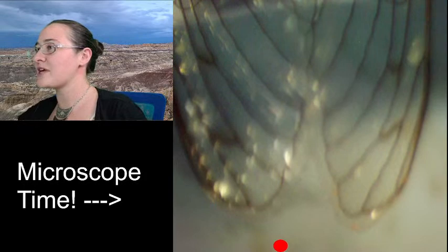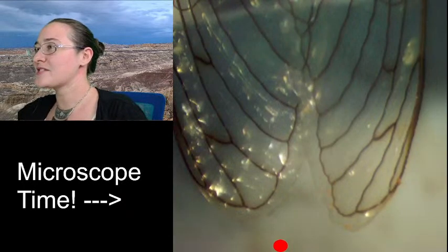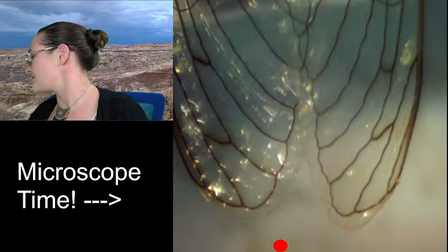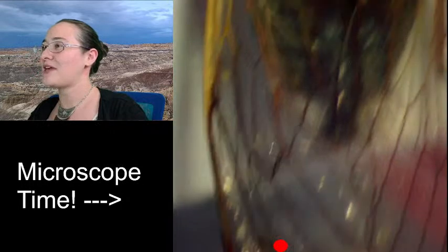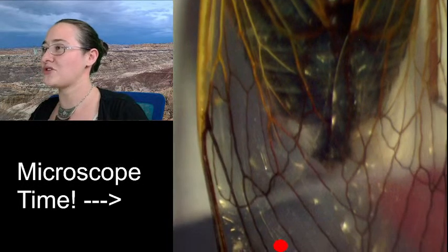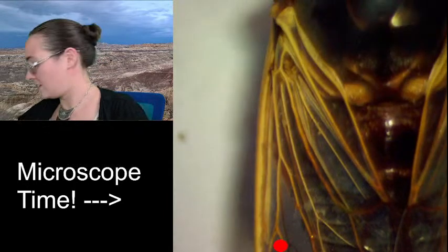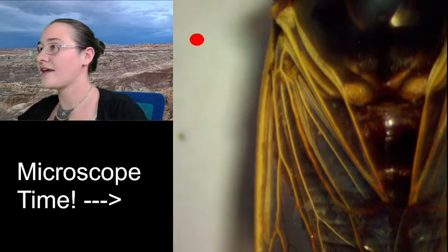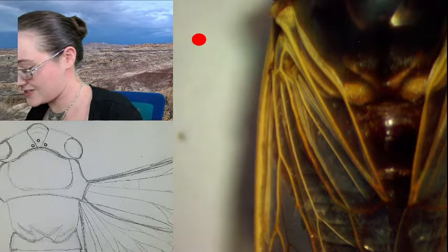This specimen is just a little bit off-center, but generally when they're alive and happy, they hold their wings central over their body. And then I can go back and we can look at the hind wing, if some of us still need to look at that.